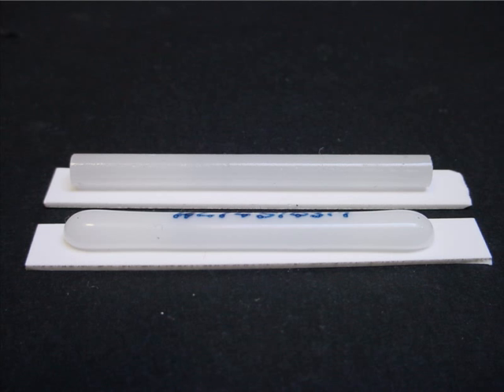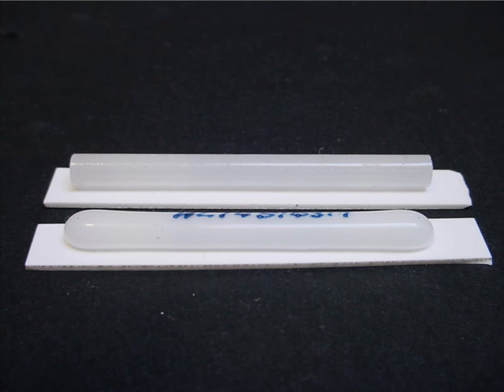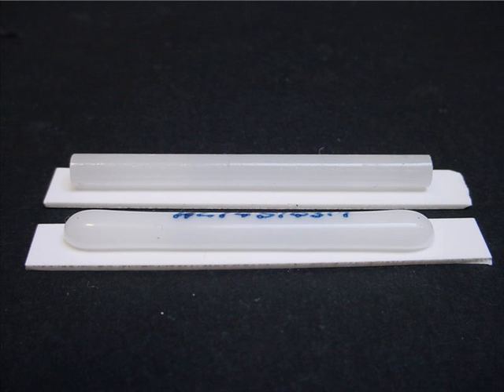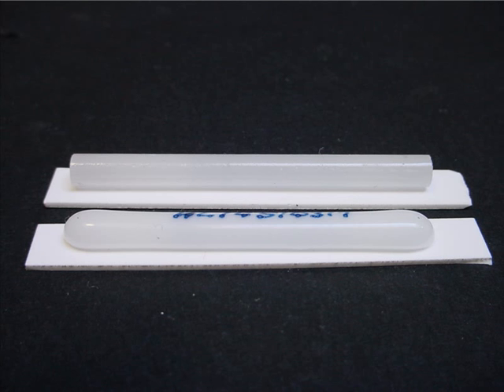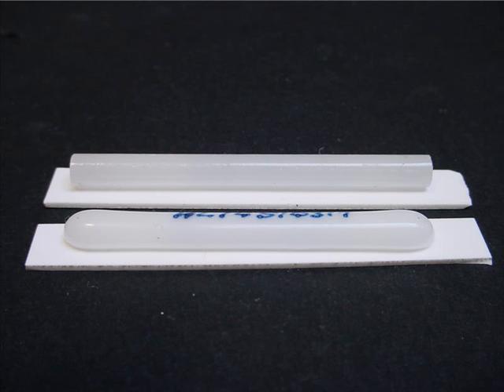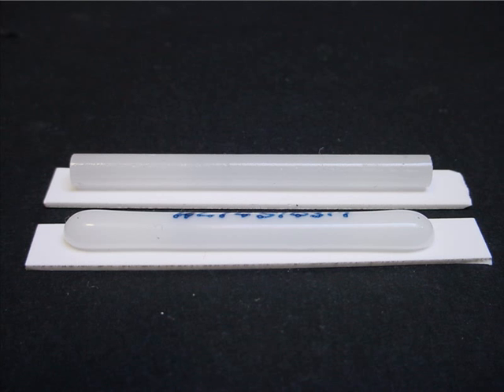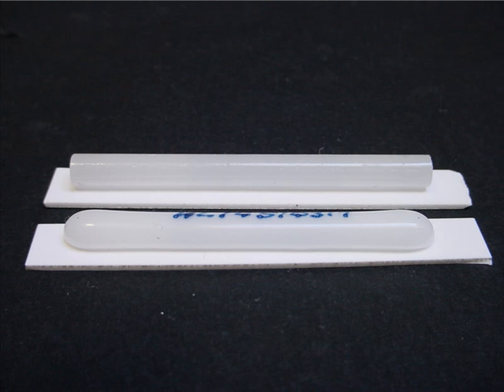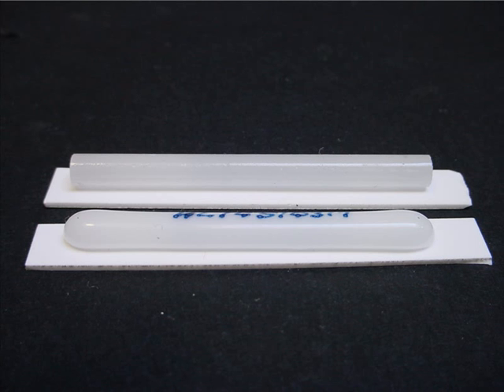Even if the material becomes plastic or liquid, there are no problems for the optical dilatometer. This is a picture of a sample of glass before and after the thermal expansion analysis. The sample was pushed up to complete softening, and it becomes shorter compared with the initial sample because the surface tension rounded the two edges.